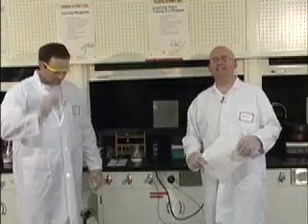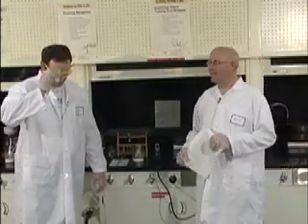Welcome to lab number 1, Chem 085. We're doing the lab of making aspirin. If you have a headache before this lab, at the end you'll have created something which you can take to hopefully ease the pain, right?